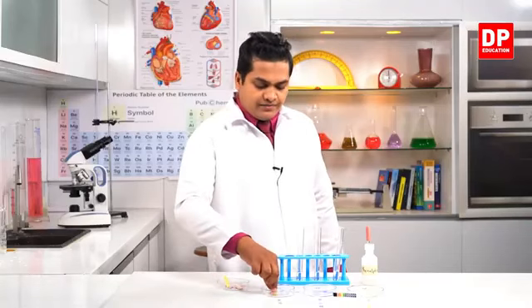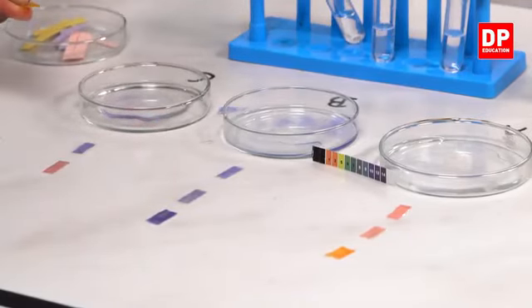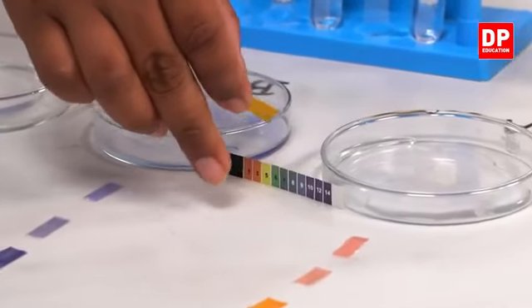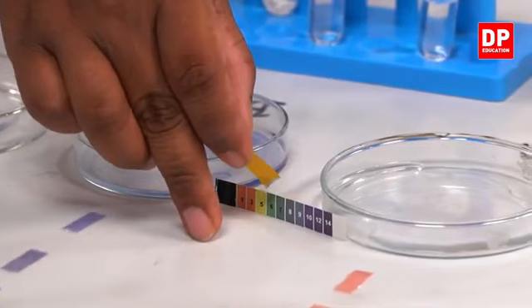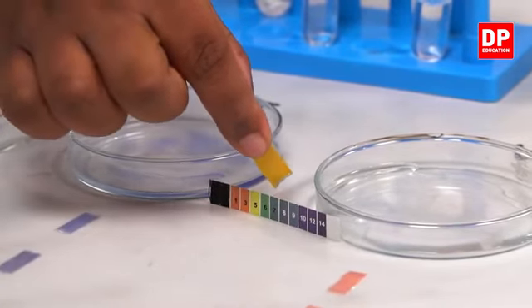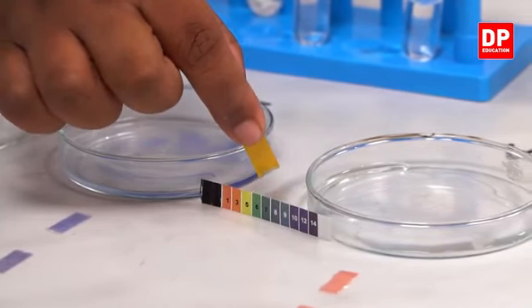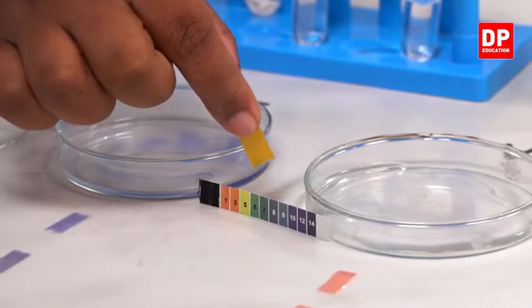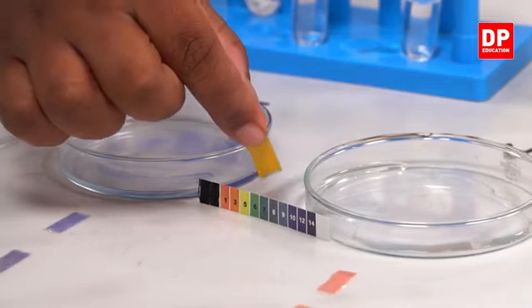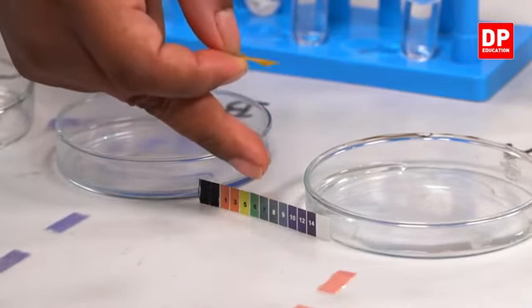Then the final one, the pH paper on the sodium chloride solution. So we'll compare the color. See here, it has a color about 5 to 6, right? It's greater than 5. It has some amount of green color.